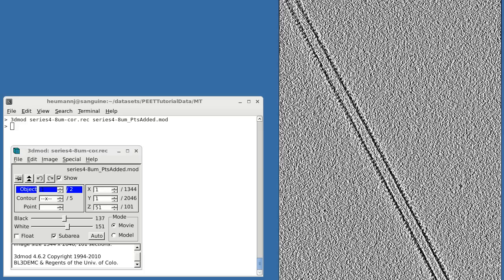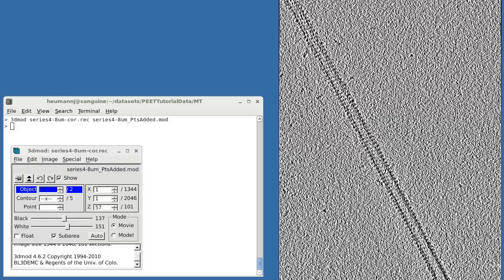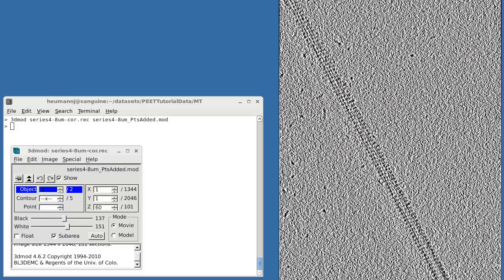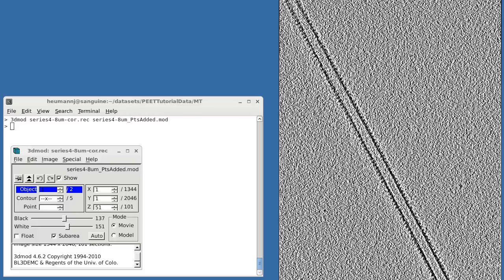Zooming in, you can see the kinesin-5 decorations protruding from the wall of the microtubule. And if I scroll up, you'll notice that the individual protofilaments running along the microtubule wall are clearly visible. The kinesin-5 protein decorates beta-tubulin subunits, which occur every 8 nanometers along each protofilament.